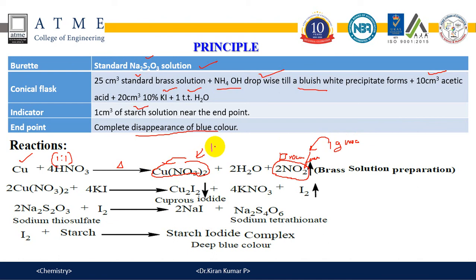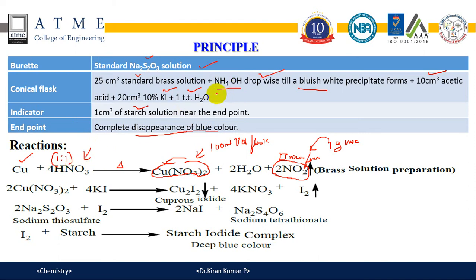Make up to the mark in a 100 ml volumetric flask and calculate the concentration. The sample is now in the form of copper nitrate. To 25 ml of brass sample, ammonium hydroxide is added dropwise. The reason for adding ammonium hydroxide is to neutralize the mineral acid — HNO3 — present from preparation. Add dropwise carefully until it becomes bluish white precipitate. Then acetic acid is added to maintain an acidic medium, since a mild organic acid is needed for the reaction.